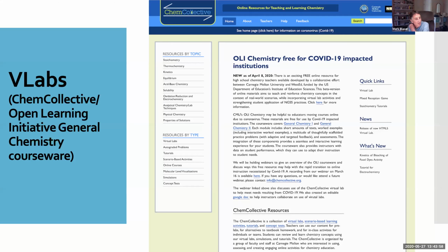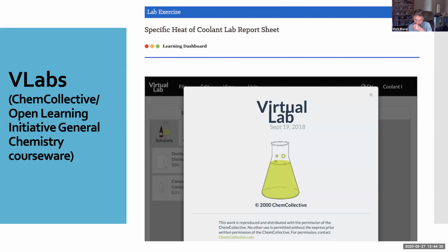Okay. The next one is VLabs, or virtual labs, out of the Chem Collective, which is kind of combined with the Open Learning Initiative at Carnegie Mellon. The Open Learning Initiative chemistry courseware has actually been made free for COVID impacted institutions. Again, I believe through the summer, not sure about the fall, and I'll mention another thing about that in a bit.